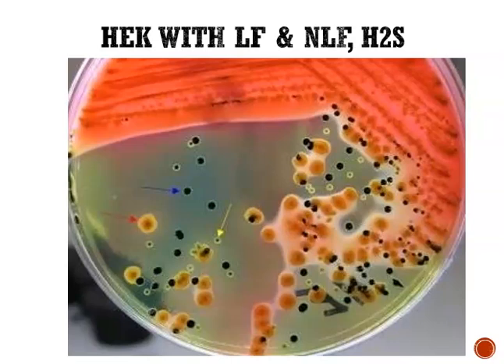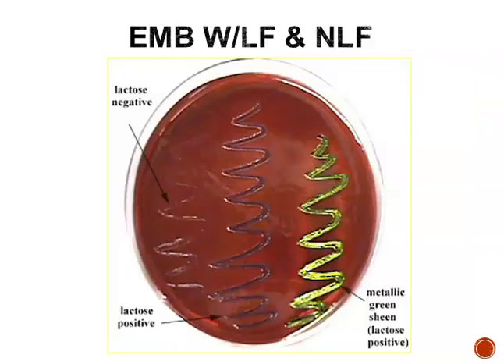And we've seen this same picture a few times, I believe, but we've got Hektoen with a lactose fermenter, which is up here, the orange. We've got hydrogen sulfide production that we can see there, as indicated by that black colony. And if you look at some of these smaller colonies outside of the black dot, you can see the edges of the colony are kind of green, so they're non-lactose fermenters. We've looked at this same picture with the EMB previously also. So we've got 3 organisms growing on this plate.